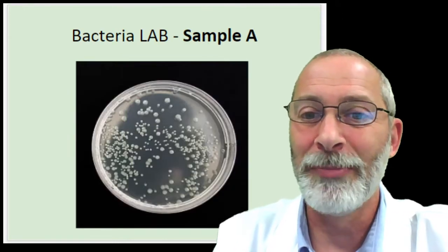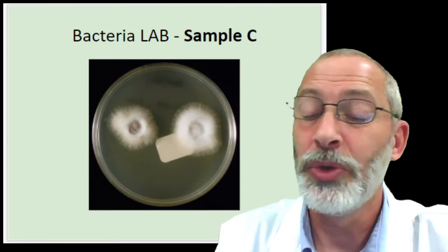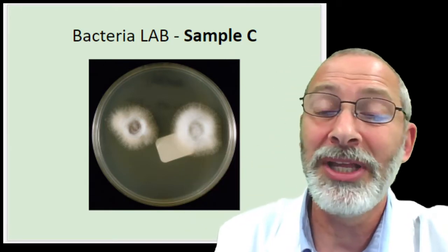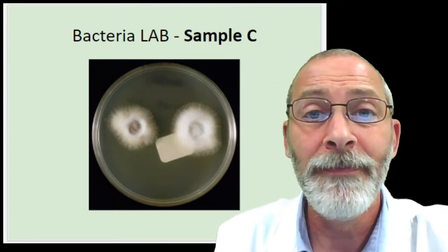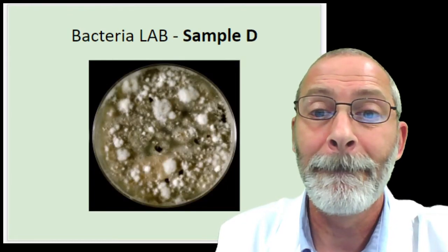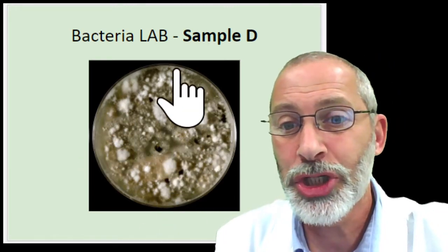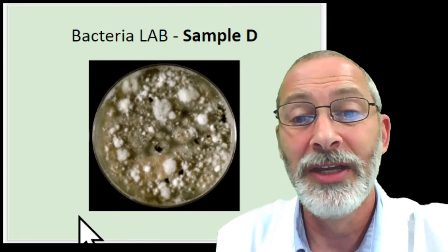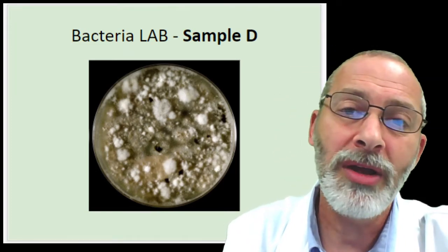I'll go back again. Here's sample A, sample B, sample C. Which one do you think is supporting the greatest population so far? And now we have one more sample to compare it with: the floor in the classroom beneath your feet every day. Check this out. Here is a collection of bacterial cultures from under your feet. Think about where you walk each day.